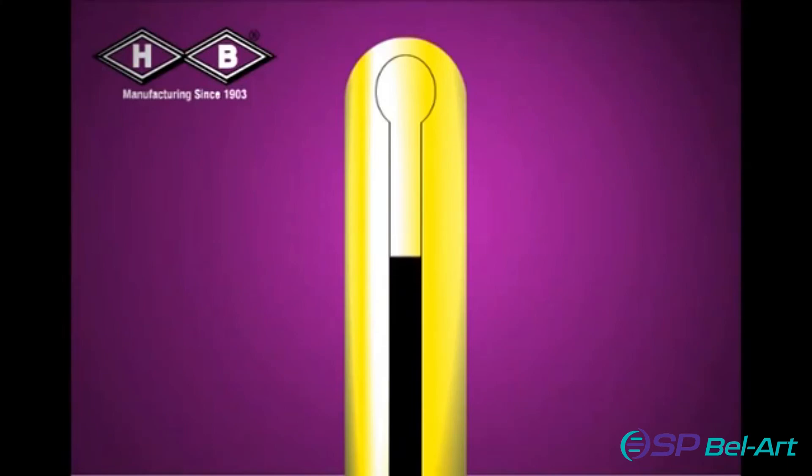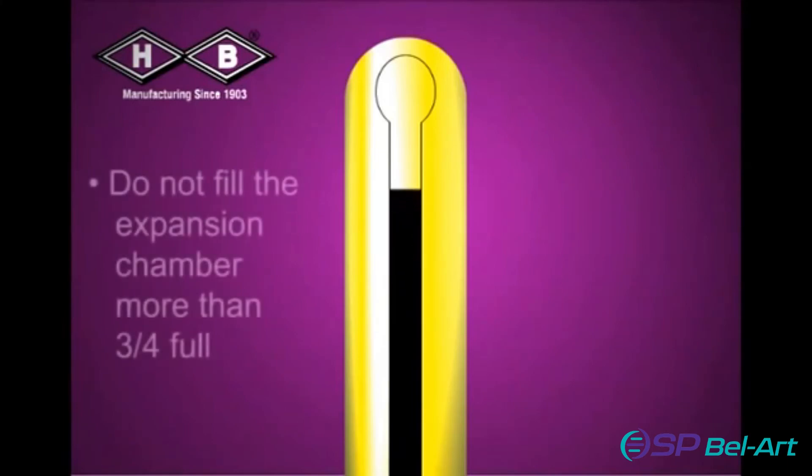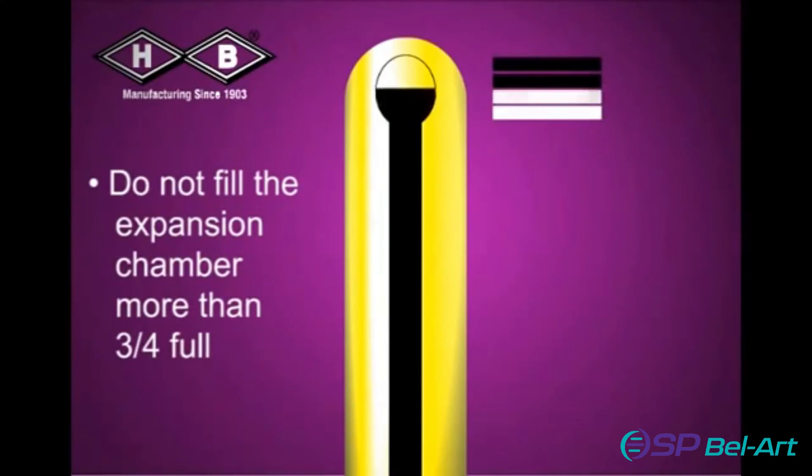Overfilling the expansion chamber will break the thermometer. Try not to fill the expansion chamber more than three quarters full.